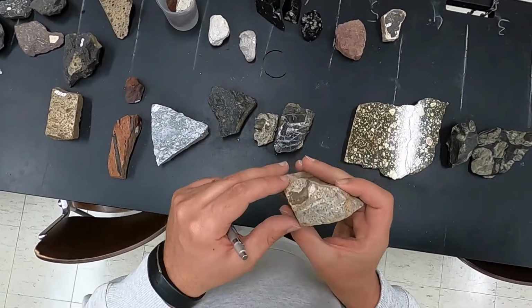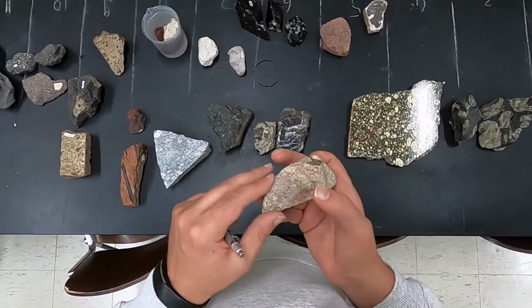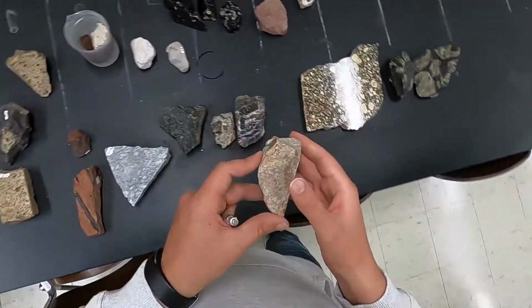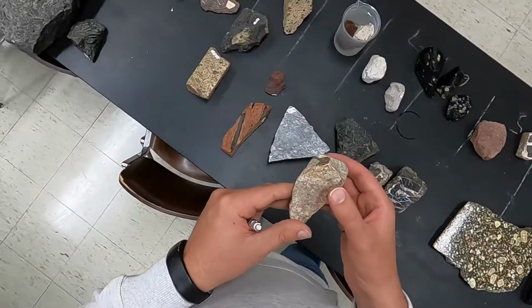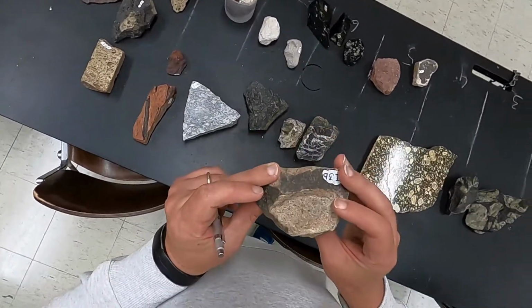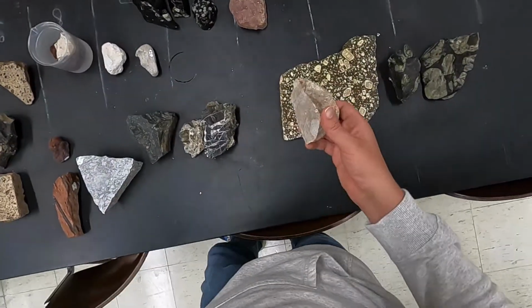We need to identify some of the minerals if we can, and also evaluate if there is free glass in this rock to make sure that we are classifying the rock correctly. If it's a latite, it will have very little or no quartz, and in those cases we tend to have no evidence of free glass in the rock, basically.